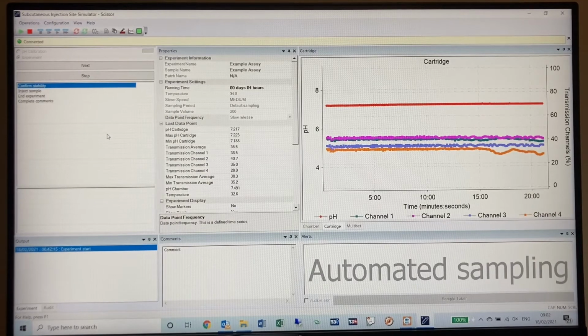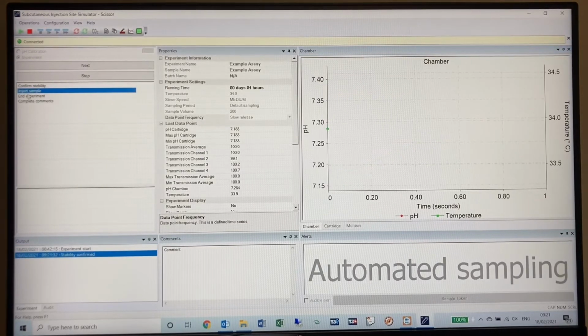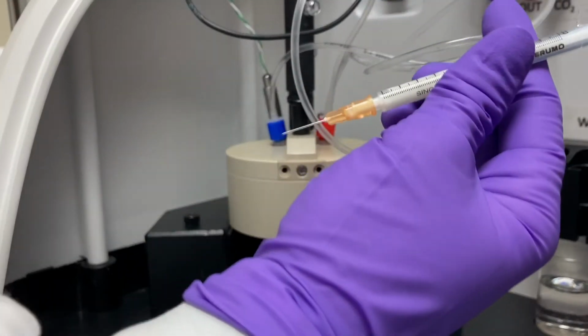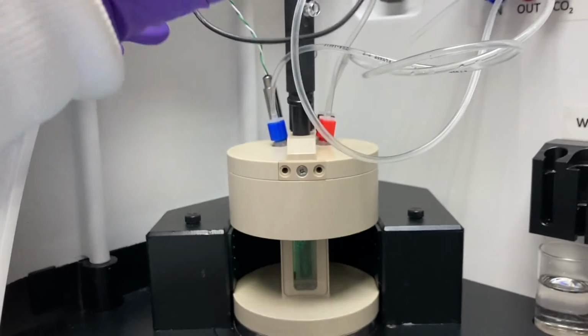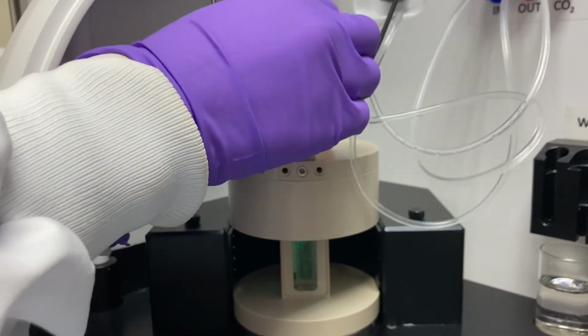Before starting an assay, we make sure that the system is equilibrated by looking at the chamber pH and temperature, as well as the LEDs. Once this is completed, we can inject our sample slowly to ensure proper depot is formed. Once injected, we then click Next on the software, acknowledging that the sample has been injected and that the assay can be left to run.